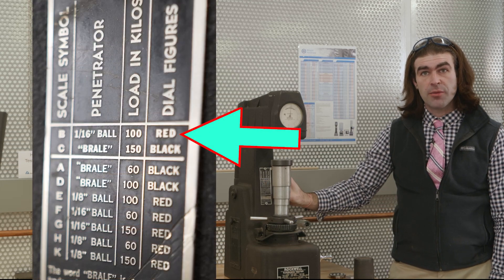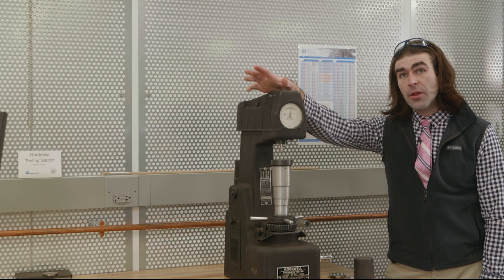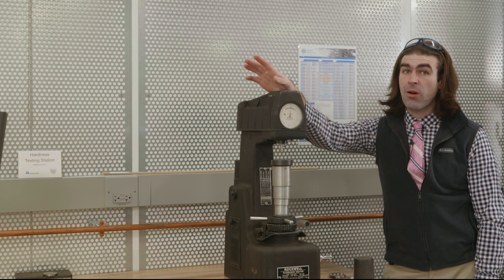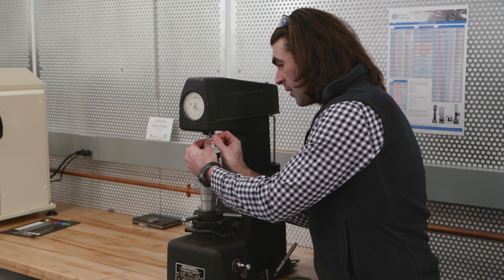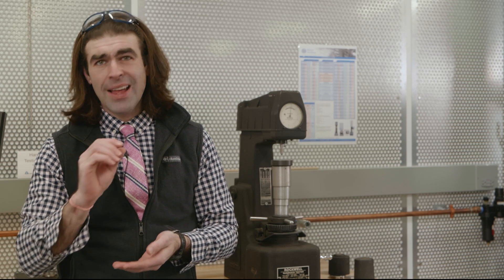Which numbers to read is printed on a tag on the machine, so find either the tag or the user manual for your machine, since different machines can operate differently. The Rockwell B test runs just like the Rockwell C as far as operation and is used for softer materials. The Rockwell A test uses only 60 kilograms of load with the diamond brale indenter — the same one used for Rockwell C. Rockwell A is for hard materials where you don't want to penetrate as far, such as case-hardened surfaces with a thin hard layer over soft material. Using Rockwell C on those could punch through the hardened layer and measure the soft material underneath.